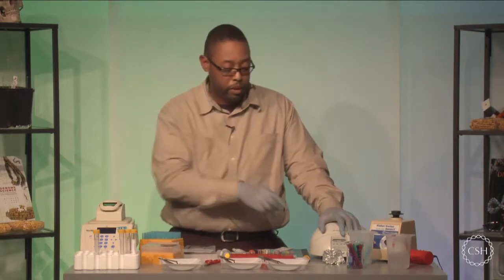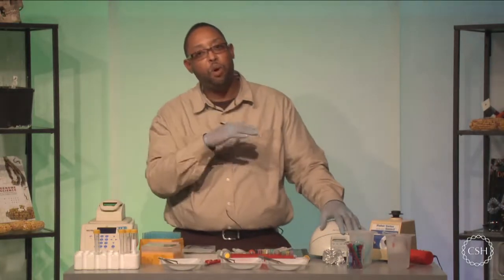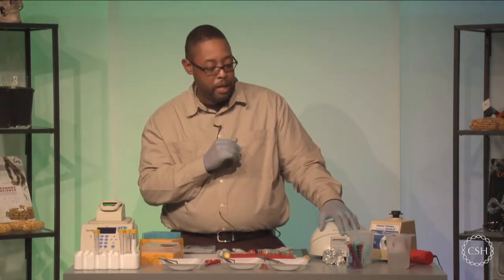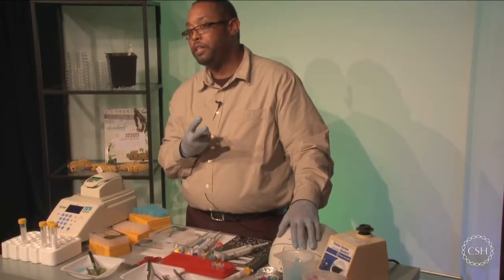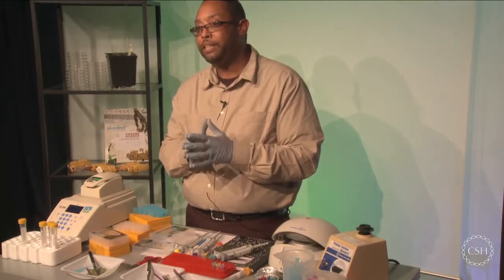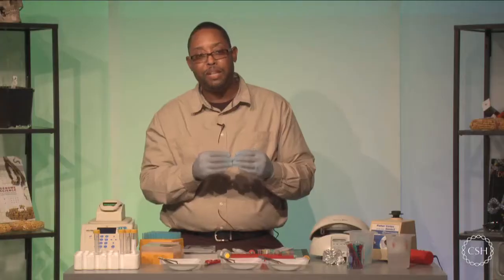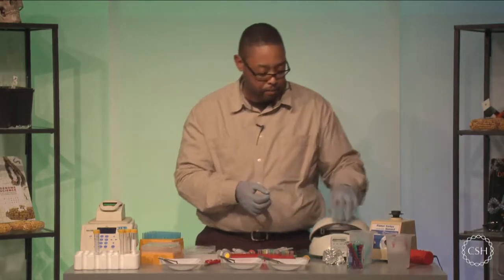So what we're going to do is stop this, and just make sure we have enough time for all the silica resin to be attached very well to the bottom of the test tube. You may have to do 2 rounds of spinning to ensure that you get all of the wash buffer physically off, because we don't want any of the alcohol inside of the wash buffer to be still around or present. We want to make sure that it's as free of alcohol as possible during the elution, because that will allow you to get the greatest amount of DNA yielded at the end.